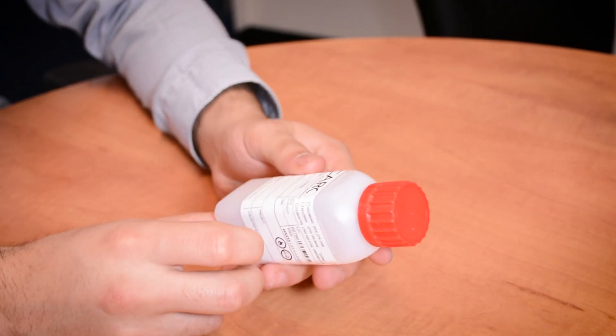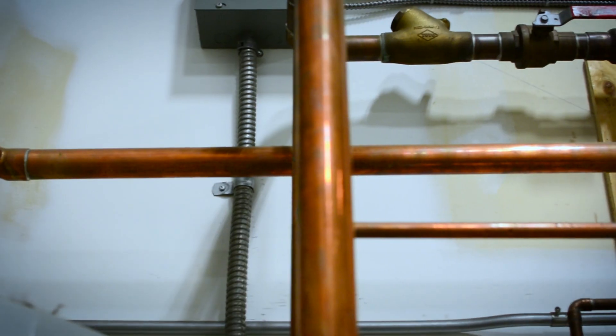The second container is the one with the red cap and it's meant for metals testing. Some of the more common metals that you may be looking for are copper and lead.